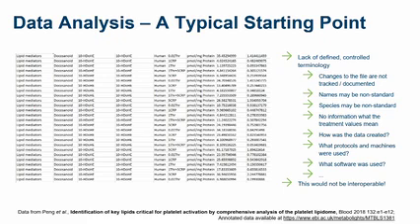So for mzTab-M, we need some sort of motivation. Most of you have probably seen something like this before: just an Excel table with some identities, your sample information, molecule names, maybe some information about treatment and concentrations. In some form or way, this is usually the basis of what you would report and also submit. But of course, this has some issues. There's not really a defined vocabulary available. That's just your own internal vocabulary, basically, that might work within your group. So everything here is not really standardized.